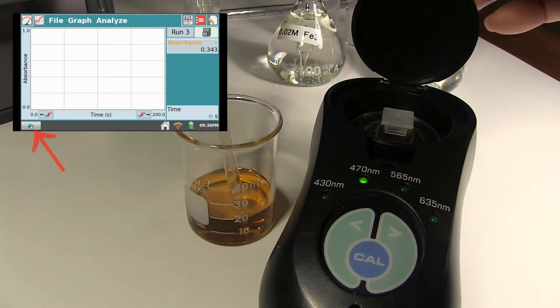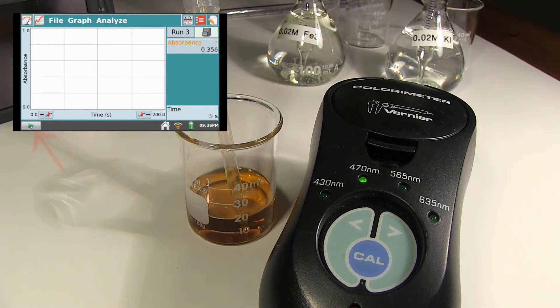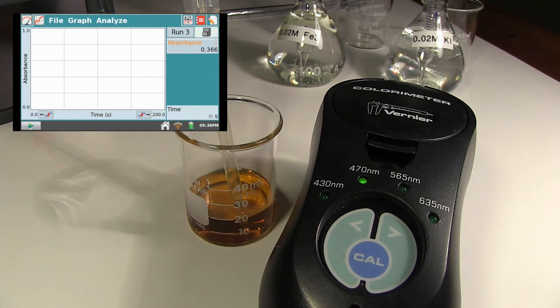Now select the play button on the LabQuest to start data collection. The data collection will be complete at the end of 200 seconds. This will give you the data for the first run.